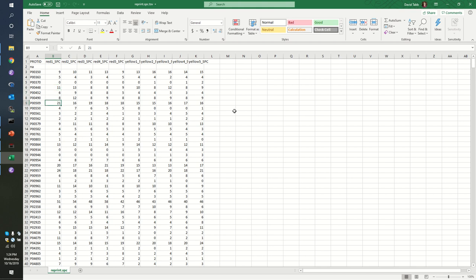You will also note that it's not giving you a statistic to say what is the rate ratio between the red and yellow cohorts. It just knows that this one's called red 1, and this one's called red 3. It hasn't done the work for you of computing a metric that says this is a protein that's differential. There are, however, many R packages produced now that are happy to take these tables in and provide an answer for you about their differences. So you can see that we had to wait a little longer, but on the other hand, we didn't have to install any other software.